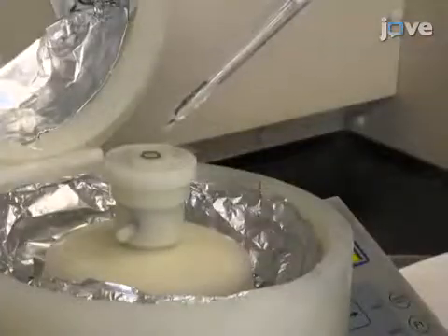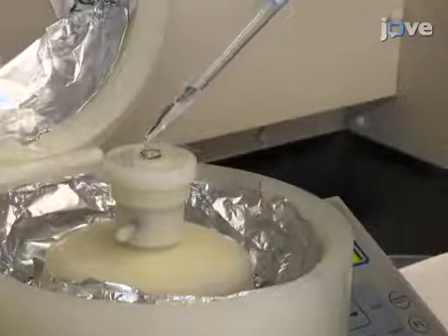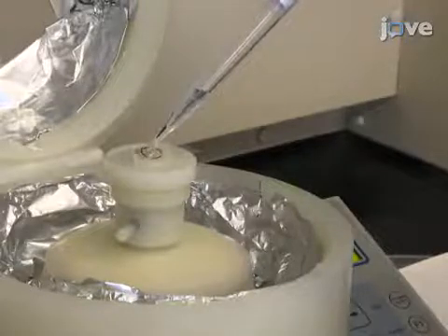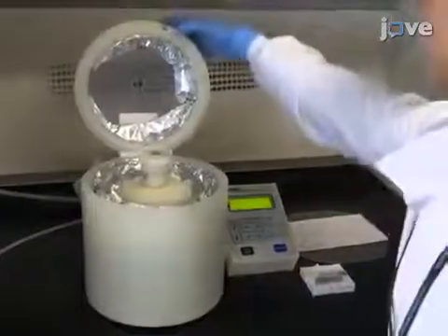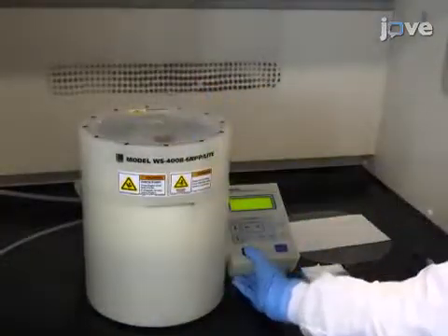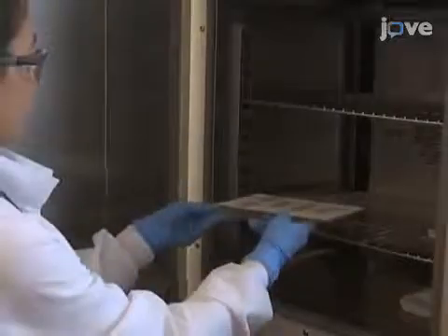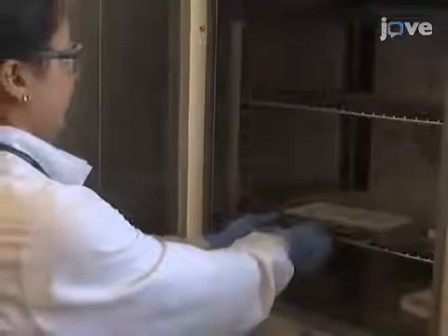Using a wide-bore pipette, drop 1 milliliter of the mixture centrally on a cover slip. Then spin coat the cover slip at 2000 RPM for 60 seconds. Make 5 or 6 coated cover slips in this manner. To cure the cover slips, keep them in a 60°C oven for 12 hours.